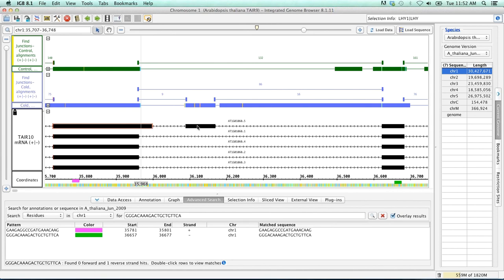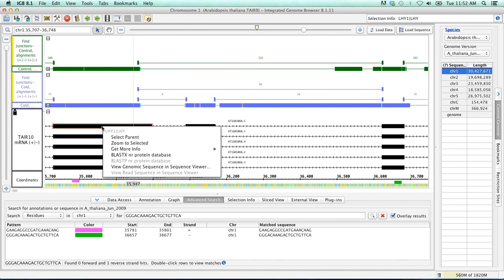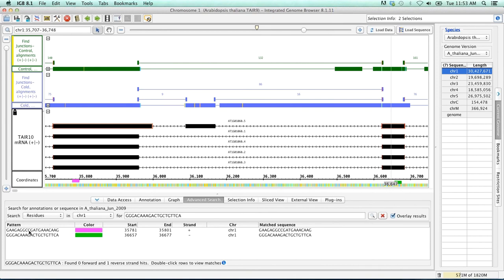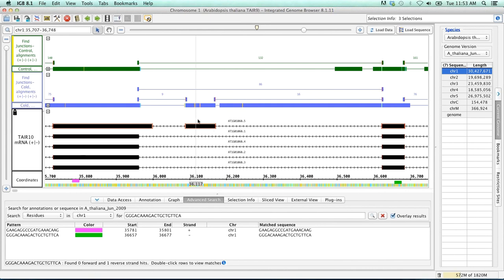Yes. So I won't go through all of how to do it, but basically what you could do is you could select this genomic sequence here for this version. And then if you wanted, you could actually go back into Primer3, load in your new exons, and then you could actually tell Primer3 what your primers already are and then it will help you calculate exactly what that length will be. Yeah, and so I'd have to highlight all three exons, wouldn't I? Yeah, if the exon was included, yes. Or you could determine the length of these two and then add on the exon.